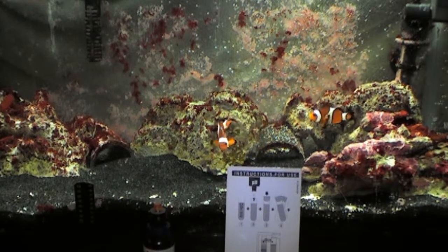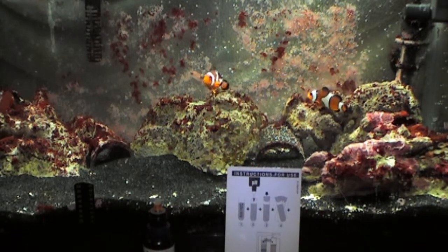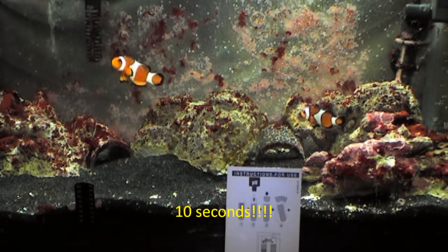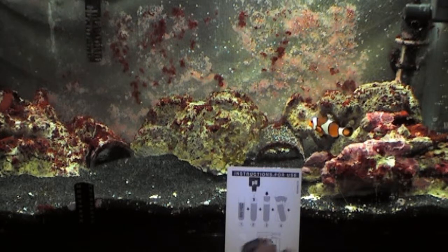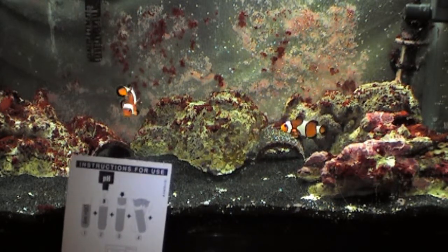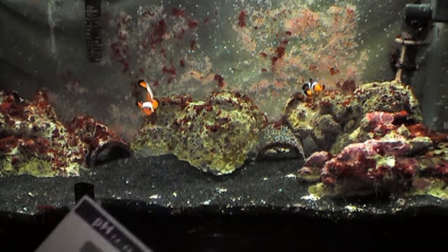Shake it gently for about six seconds and then compare the results with the test card. For this test, to read it correctly, you need a white background and you need to hold the test tube about eight inches from that white background.